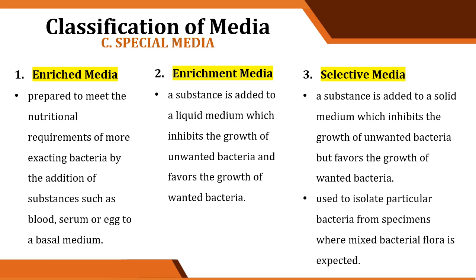Number 3 is selective. Selective is when a substance is added to a solid medium which inhibits the growth of unwanted bacteria but favors the growth of wanted bacteria.